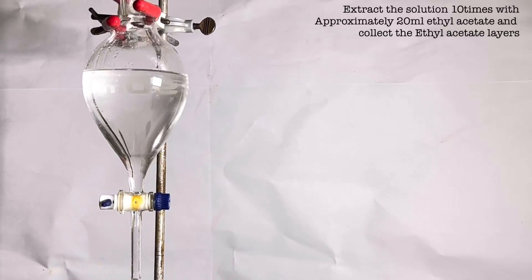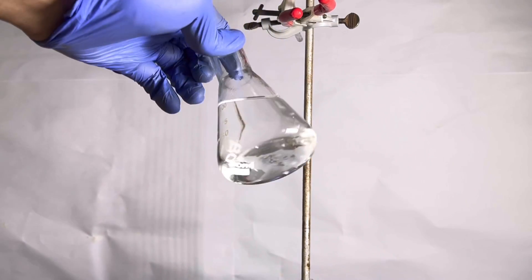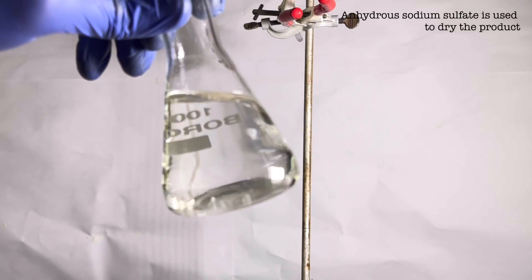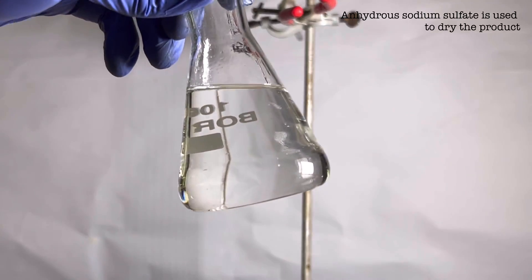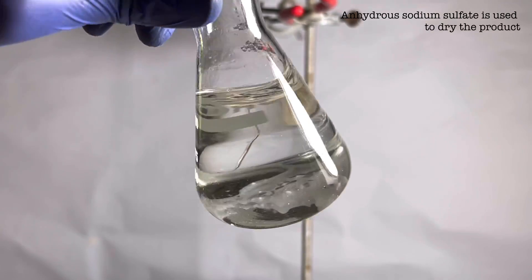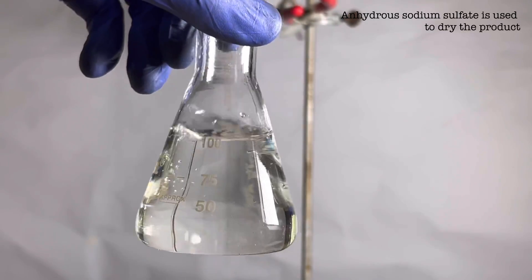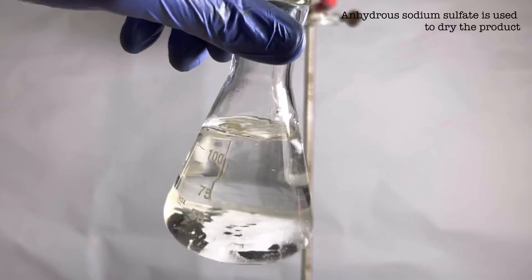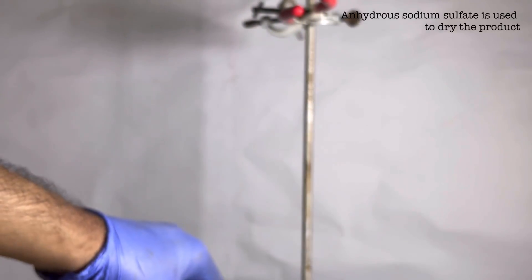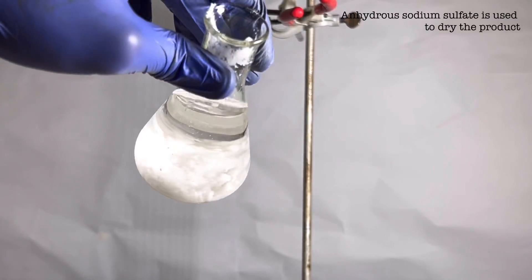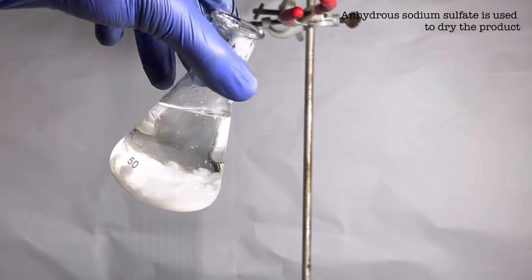The conical flask containing the ethyl acetate layer is taken. We will remove water by adding anhydrous sodium sulfate. Initially on adding the sodium sulfate it sticks to the bottom of the flask as you can see here. This means that there is more water in the content and more sodium sulfate needs to be added. So more anhydrous sodium sulfate was added until we see free flowing of the salt in the bottom of the flask. This indicates that the solution is free from water.